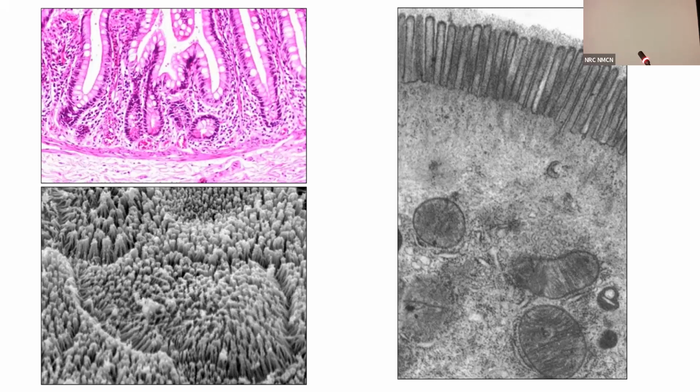If you want to see the surface topography, you do the scan. Which figure is scan? Left side, below, scan. Okay. So that is a light microscopy picture. This is a scanning electron microscopy picture. This is a transmission electron. Now you understand the differences.